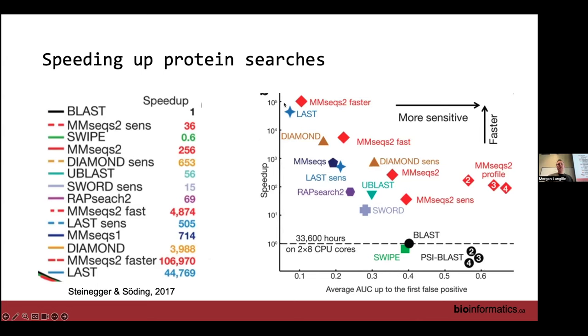Again, I wouldn't say it's the most used normalization out there. It's an interesting paper. I would check it out, and I'll put it in the Slack afterwards so you can take a look at it. I wouldn't say it's routinely used. It does make sense, but it's one of those worries down the list of things to worry about for normalization. It exists, it's out there. Also, unless you're really doing things where average genome size is vastly different, it's really not an issue, right? In most cases, people are comparing very similar environments where average genome size would be quite similar anyway. People often nowadays aren't comparing soil samples versus endosymbionts or something, but it exists.